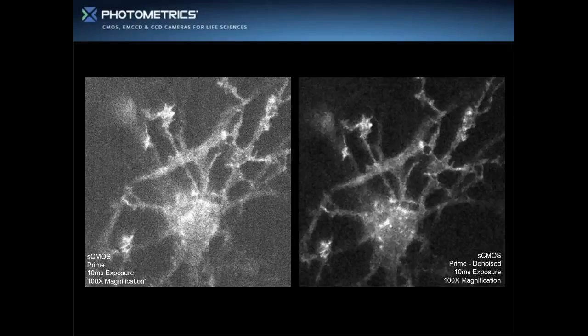Are you suggesting that we switch our EMCCD out for a BSI CMOS, and is it worth making the change? Did I ask you that one already? I'm sorry. Yeah, no, that's fine. Is it worth switching it out? No, I think your EM camera will do you just fine. But as you move forward and look at future camera purchases, I think the 95B becomes the better solution.